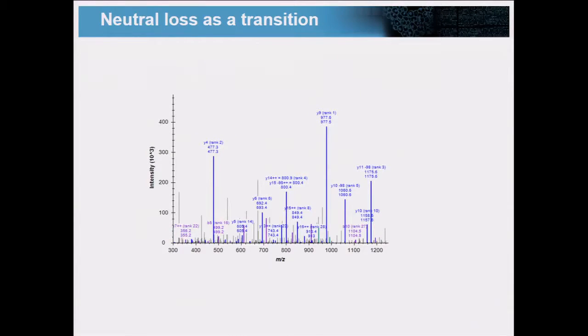And sometimes, for example in an HCD spectrum, these neutral losses are fairly high peaks. So if we chose, for example, the top 5, we would choose 3 neutral loss ions out of the top 5 ions. Quite commonly, if we just go to the spectrum, click choose top 5 from the library and do not look at the spectrum, then we would choose a lot of neutral losses. We encourage you to do this very carefully.